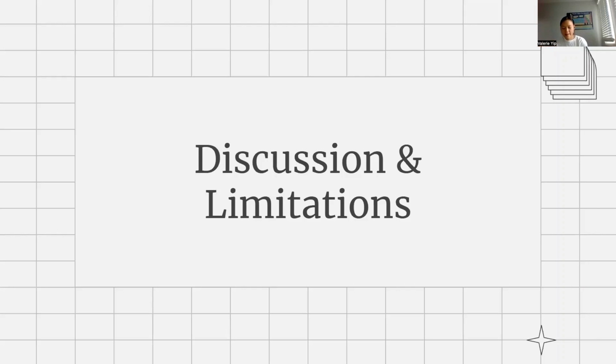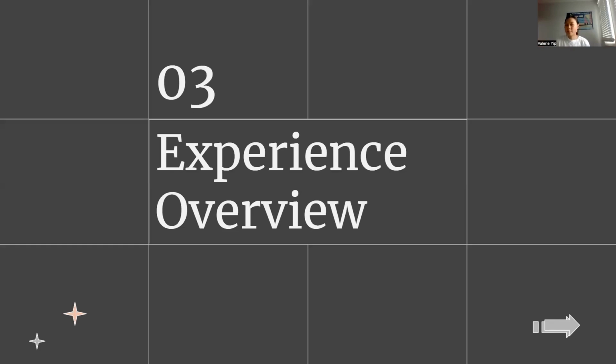Just wanted to say also, as a limitation, this program should be used in conjunction with other analysis systems, because you can only get so accurate with a system that you automate. It's obviously much better if you have the time and the patience to do all of this analysis manually. But because this analysis, especially using ImageJ, is very tedious, I just wanted to make a program that would reduce the amount of time needed to calculate mean intensity. Okay, so that's the summary of my project.